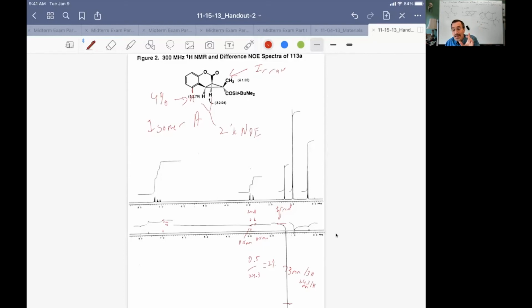And that's really nice when you can get multiple sets of data together. Now, let's suppose I only had isomer A, and I said, okay, I'm worried. I don't know which isomer A is. I think it's the one where the methyl group is trans to those hydrogens. I think I'm seeing an NOE to that ortho proton, but I'm not completely sure.